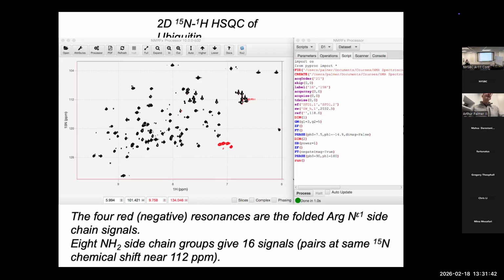And the CD3s you don't see, but then you would see peaks for the CH3s, the CH2Ds, and the CHD2s. And then by appropriately adjusting the delays in the INEPT, we could pick out which one of those we actually wanted in the spectrum.